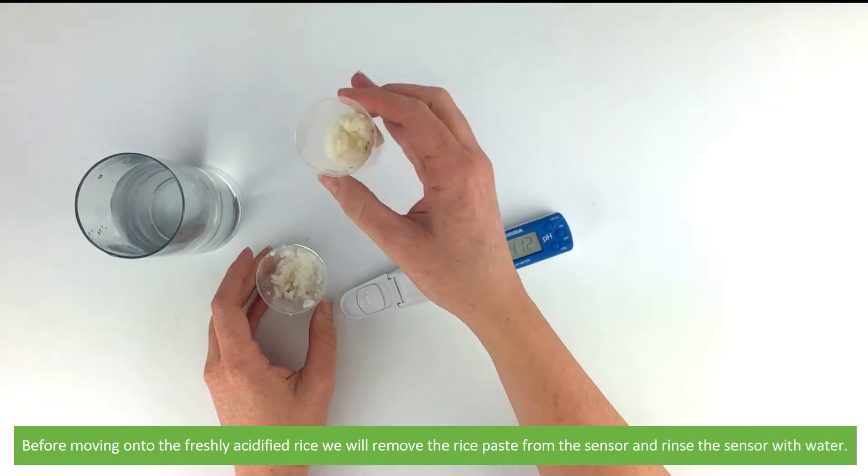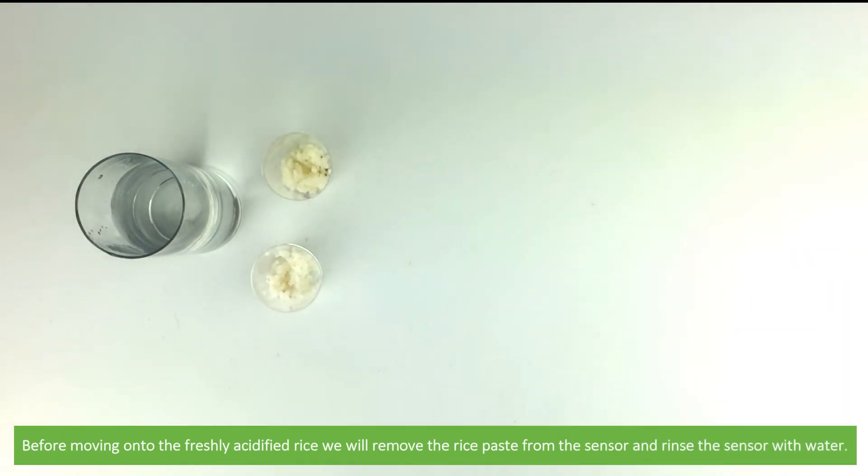Before moving on to the freshly acidified rice, we will remove the rice paste from the sensor and rinse with water.